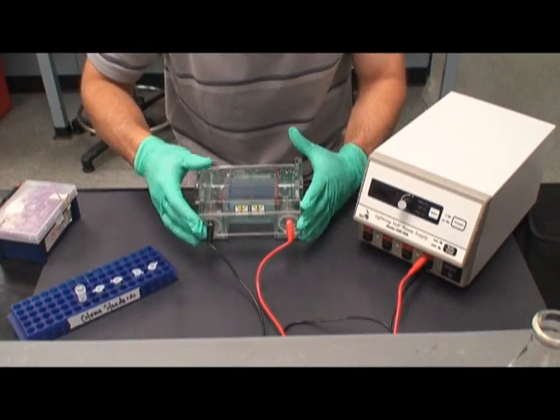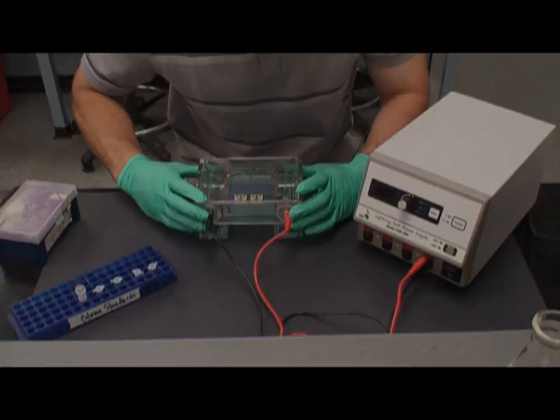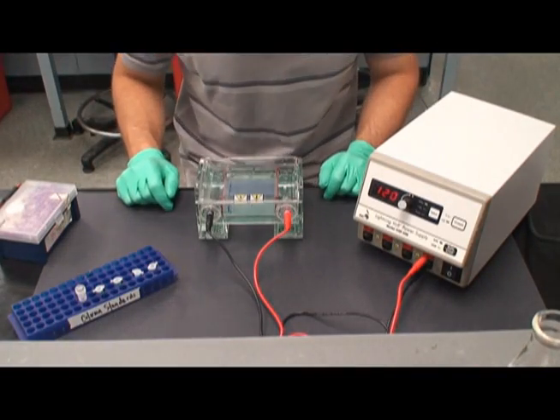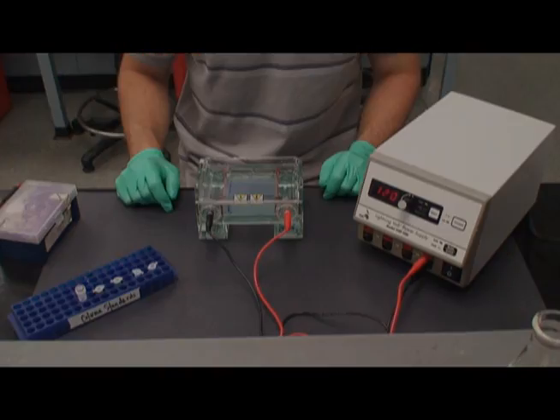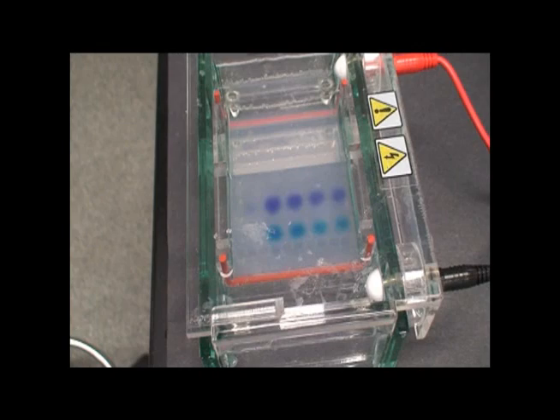With all the wells loaded, attach the cover and electrodes to the box. Set the current to 120 volts and run for 60 minutes. Remember, the gel now has current, so don't touch it as it will shock you.